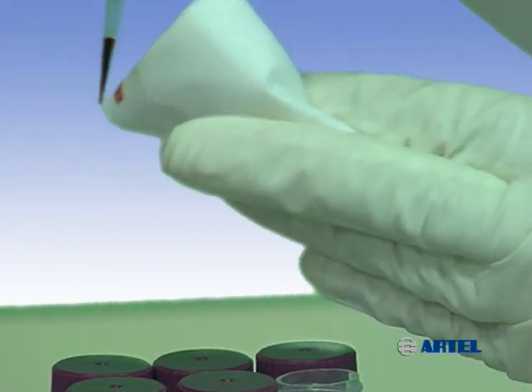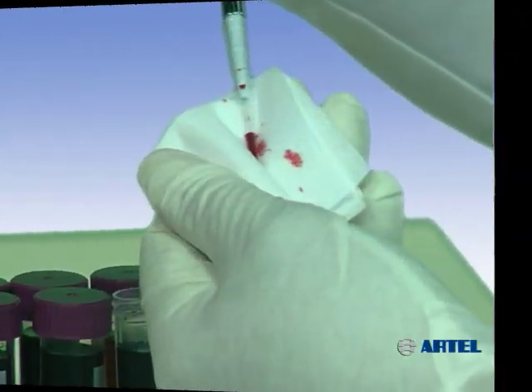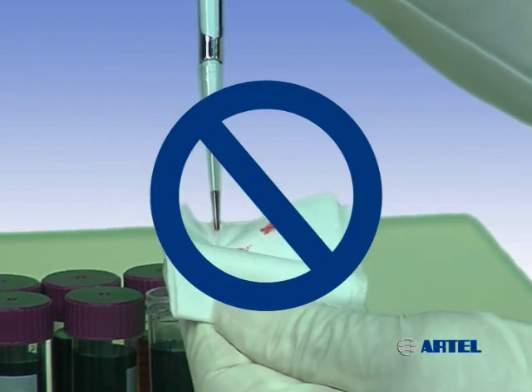If you decide to remove the extra droplets from the tip exterior, it's important to stay clear of the tip opening. Additionally, avoid a full tip wipe because this could cause sample loss due to wicking out of the tip.